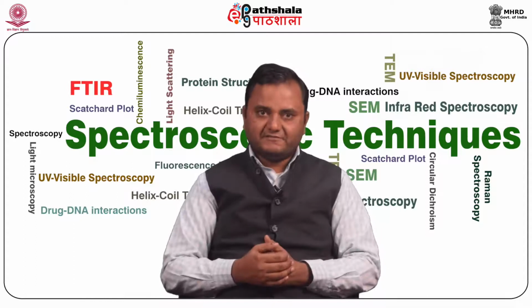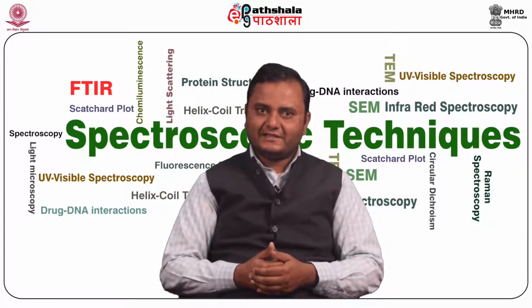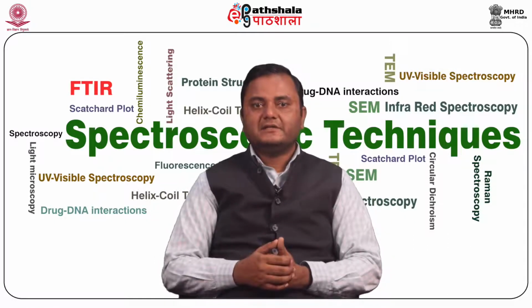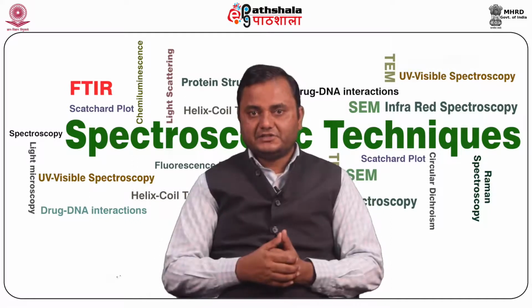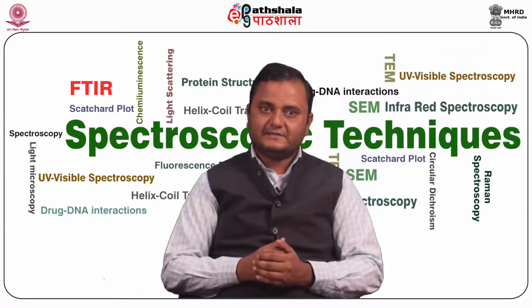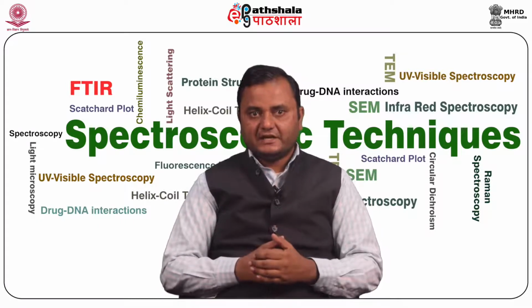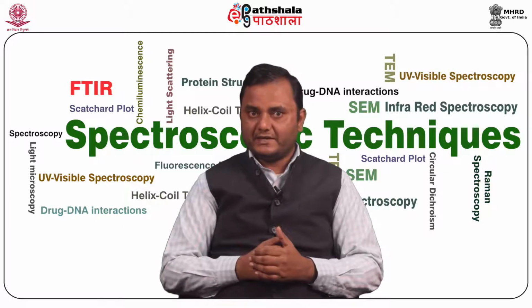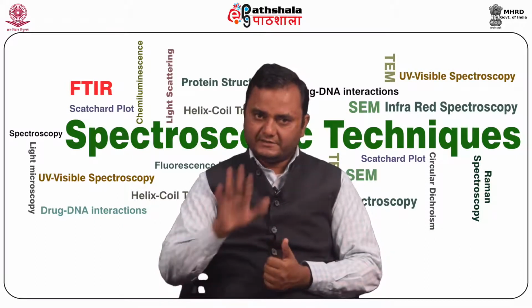Apart from all these advantages, FTIR also has some disadvantages, like the single beam. It requires collecting a blank. It cannot use a thermal detector because thermal detection is too slow a process. CO2 and water are highly sensitive. It is destructive, and too sensitive, so that it would detect small contaminants. These are some of the disadvantages associated with IR.